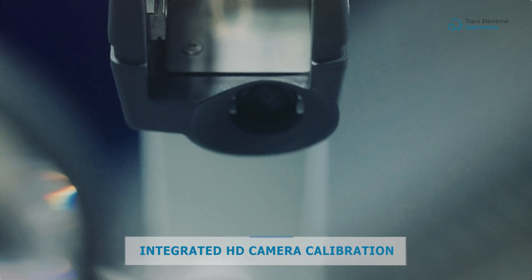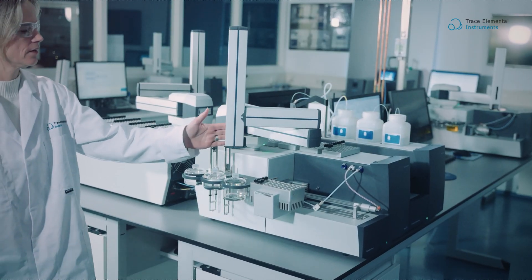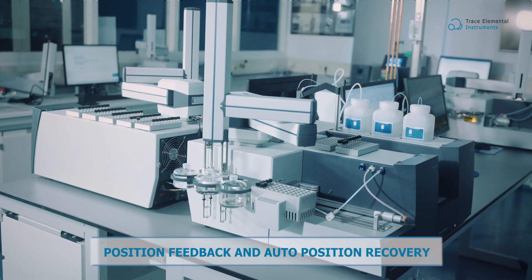The autosampler is equipped with an internal camera for automated calibration, enhancing precision and ease of use. In case the sampler is unintentionally moved out of position, built-in feedback results in automatic repositioning.